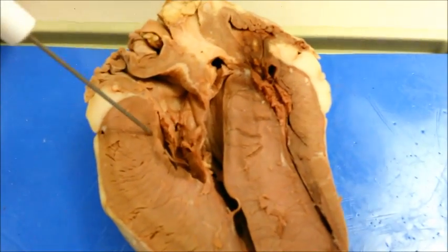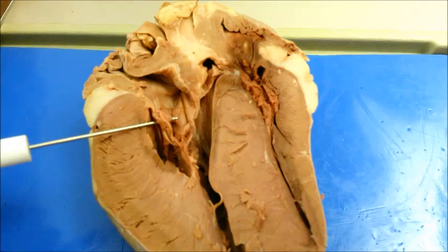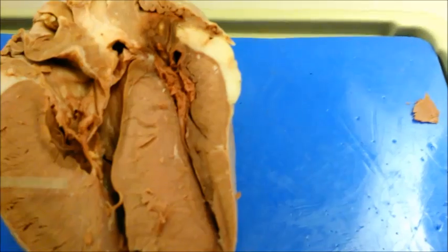The bicuspid valve, which is also known as the mitral valve or the atrioventricular valve, is located between the left atrium and left ventricle. This prevents blood from flowing back into the atrium when the left ventricle contracts.